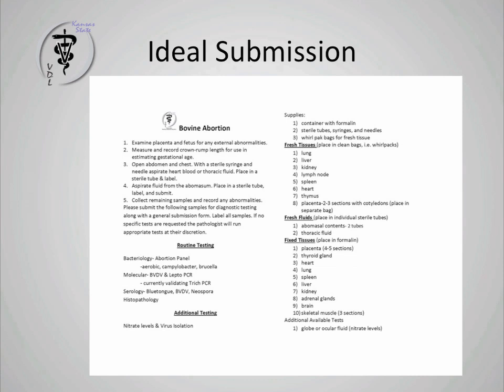So you can see here, I tried to break it up. This is all of the different wordy instructions that you can probably skip over if you want to. These are the routine tests that we're going to run, and we'll get back to that in a minute as well. And then this is basically all your supplies and tissues, samples, fluids, that kind of stuff.